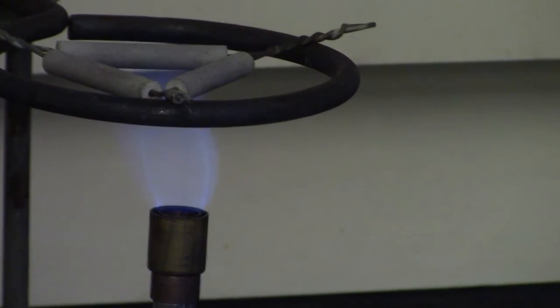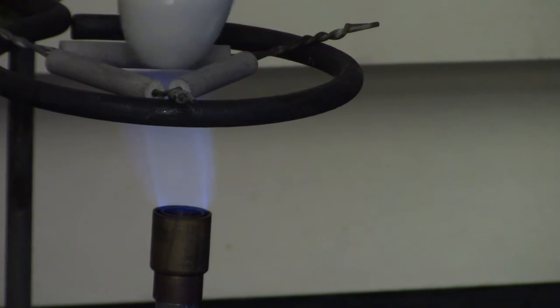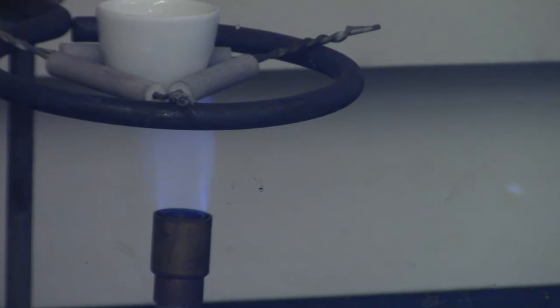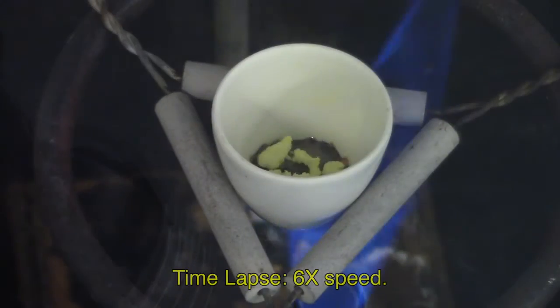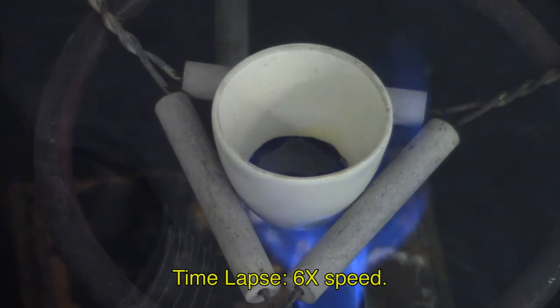Start with the cool flame, a single blue cone, to heat the 2 elements. Using your tongs, place the crucible and clay triangle in the hood and pull the door closed, which will straighten out the flame and keep the sulfur dioxide out of the classroom. Heat using the cool flame until you can see the copper wire.